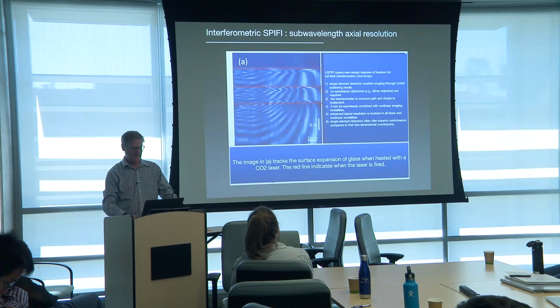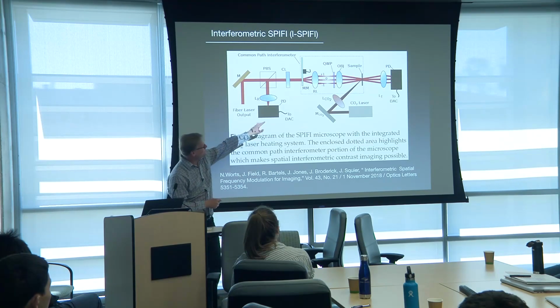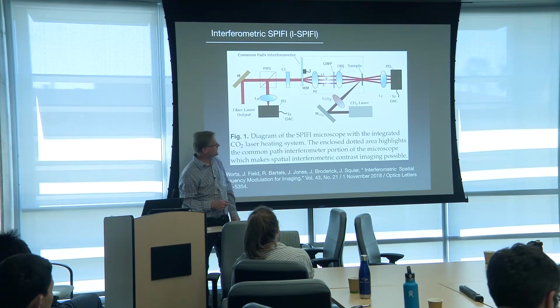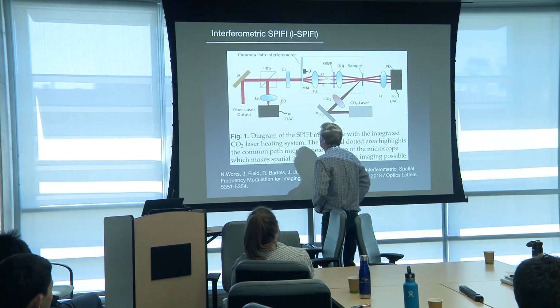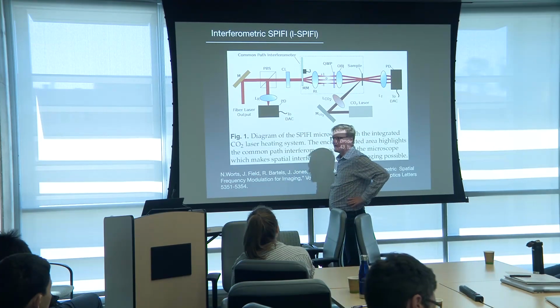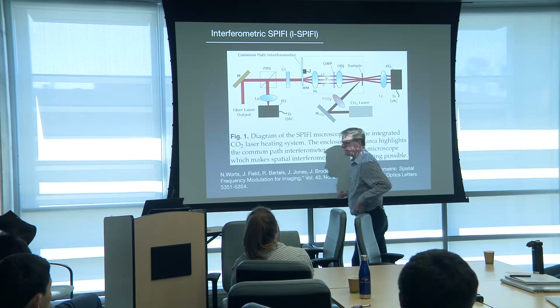So that data that you got is based on the reflection imaging, right? Yeah, so this is kind of detecting way back here. Here your photodiode is on the other side of the sample. Yeah, so this is in the epi direction. I see. So you're not using the data from the part on the right? I did not show it.